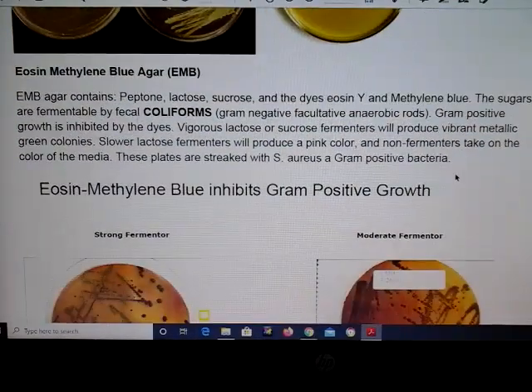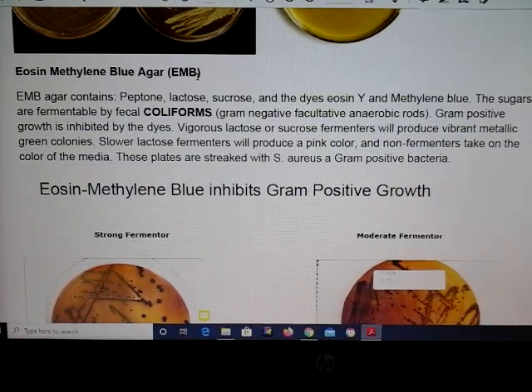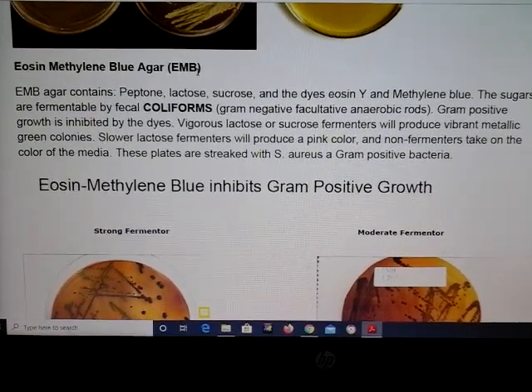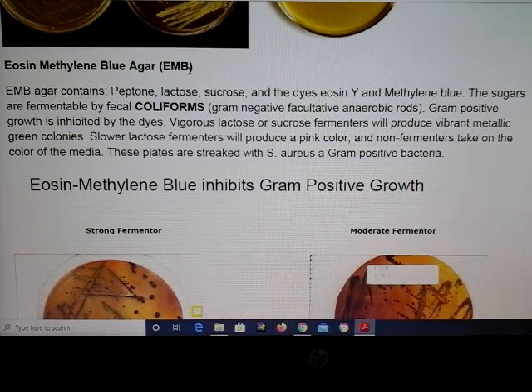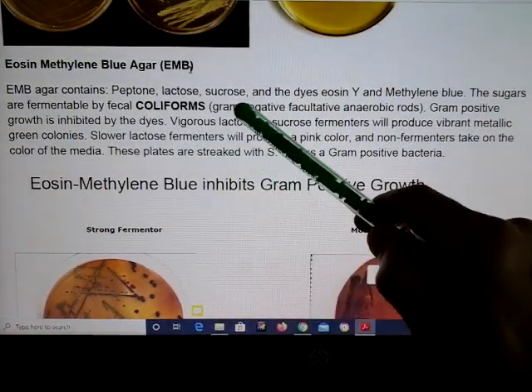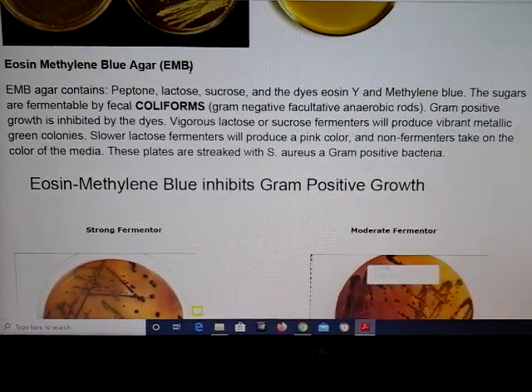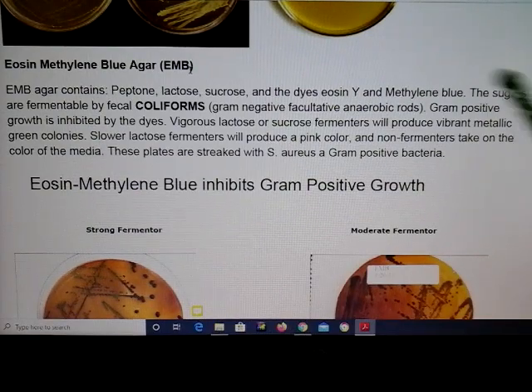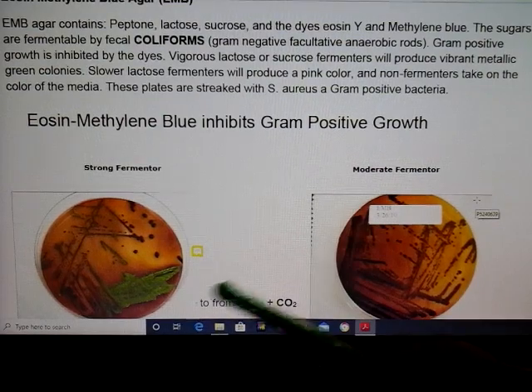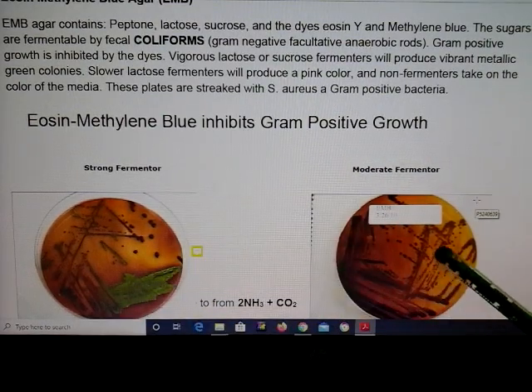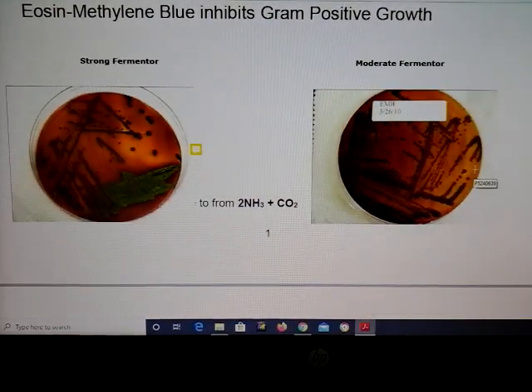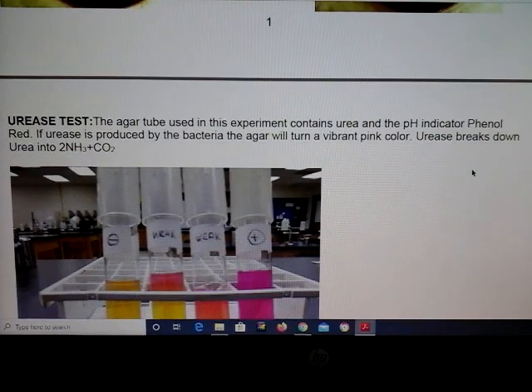The next type of plate is called eosin methylene blue agar, or EMB. The EMB agar is made up with different types of sugars and dyes. The sugars can be fermented to produce some interesting colors. We are selecting for coliforms — gram-negative facultative anaerobic rods. A strong fermenter produces metallic green, while a low to moderate fermenter will show pink to purple. Non-fermenters just take on the color of the media.